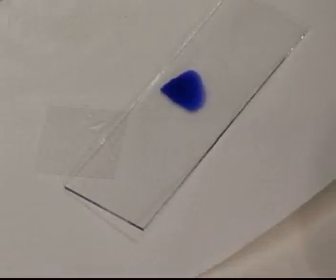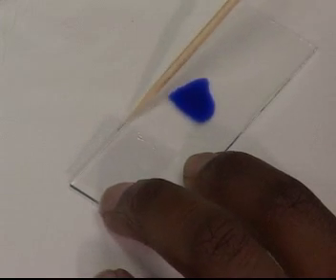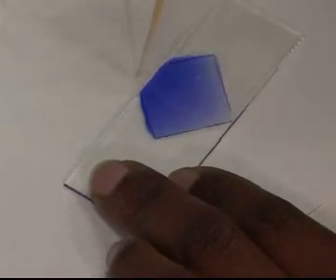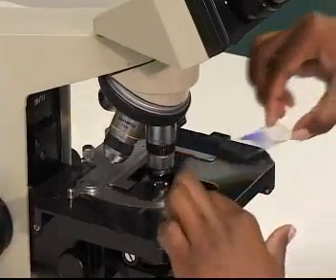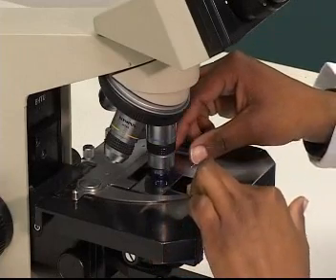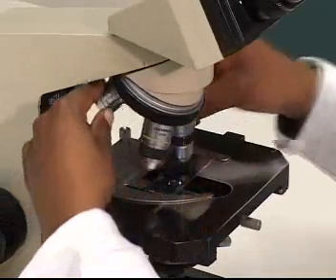To stain the slide, this time we must remove the cover slip and add a drop of methylene blue. Cover with the cover slip and again wait for about 5 minutes for the cells to become stained. Now, examine your preparation, firstly using the low power objective and then using the middle power objective. You can also carefully use the high power.